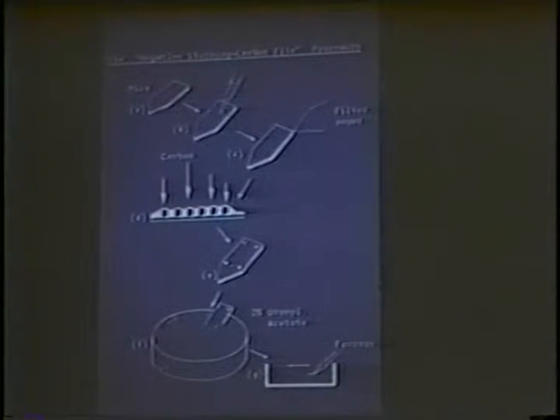Portions of the floating film are then picked up from beneath the stained surface using holey or perforated carbon films or simply 400 mesh grids. The excess uranyl acetate is then removed using filter papers, as in the single droplet procedure. The actual handling of the mica strips throughout this procedure is very easy, and each strip may provide up to 8 or 10 EM grids for study, depending on the size of the mica strip used in the first place.